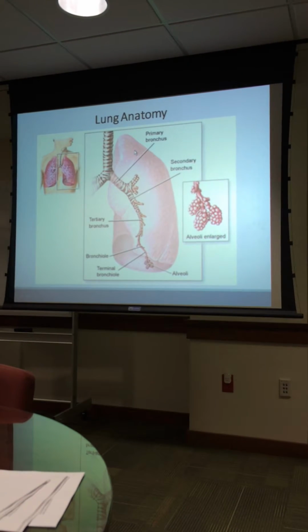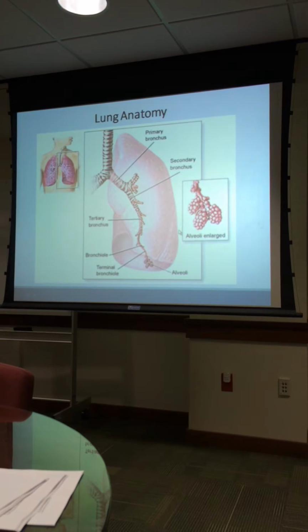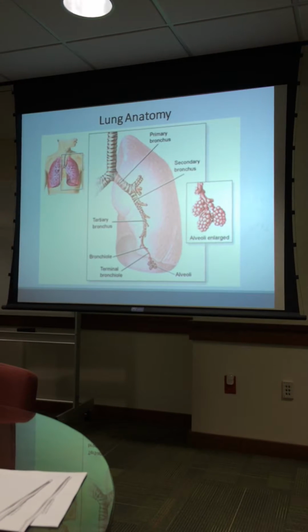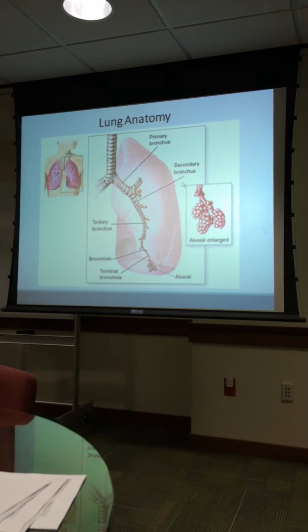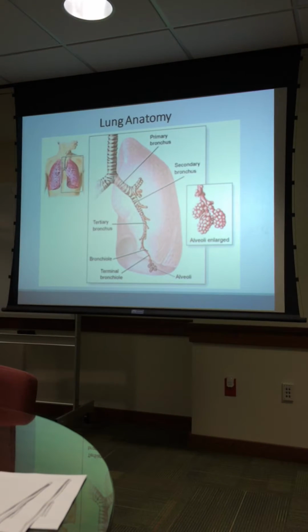With these body fluid specimens, the pleural fluid is obviously on the outside of the lung. So you're never going to see bronchial epithelial cells in a pleural fluid, because the bronchial epithelial cells are inside the trachea and the bronchi, whereas the pleural fluid comes from the outside, so we'd expect to see mesothelial cells.